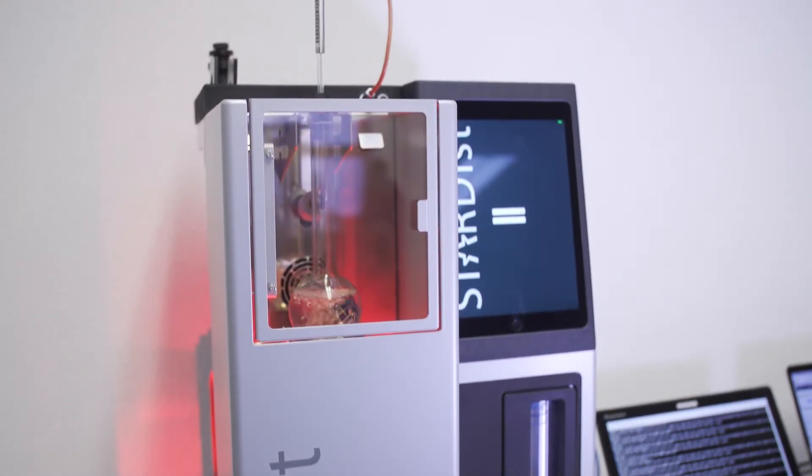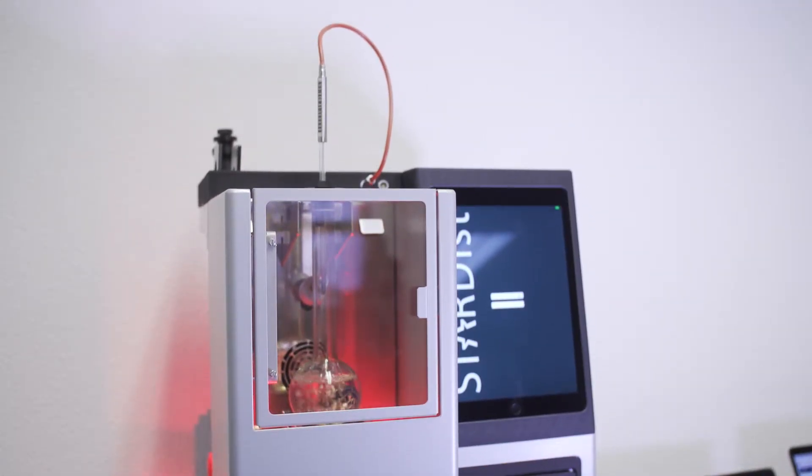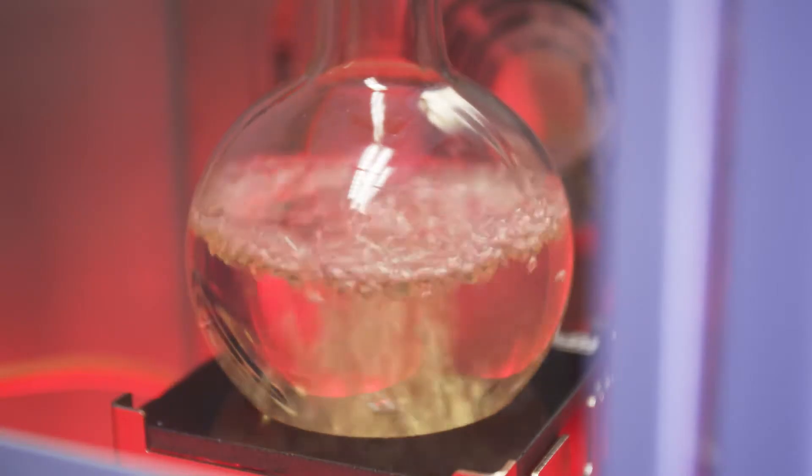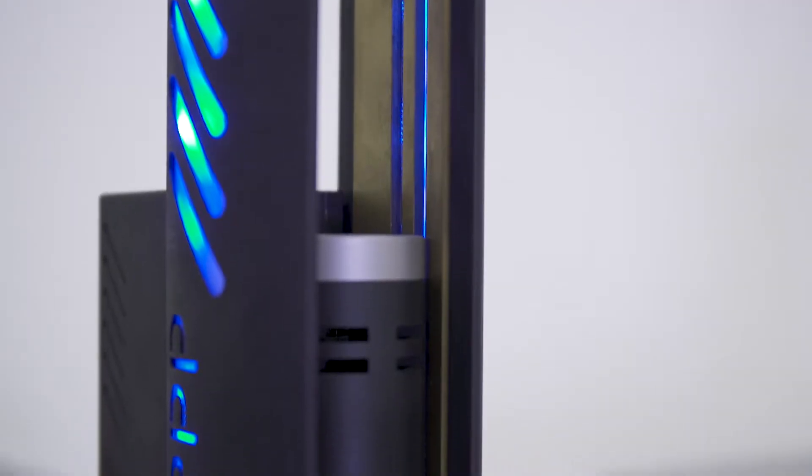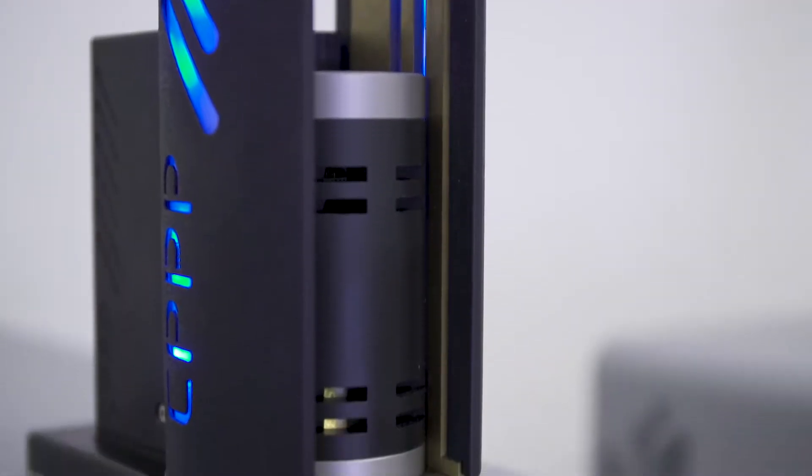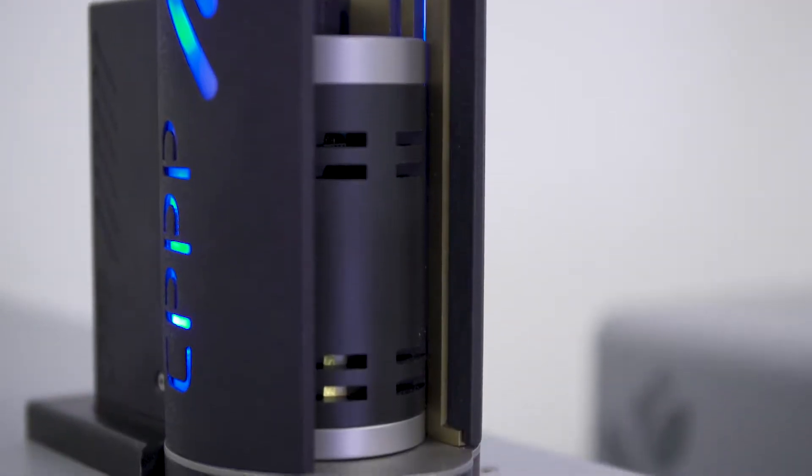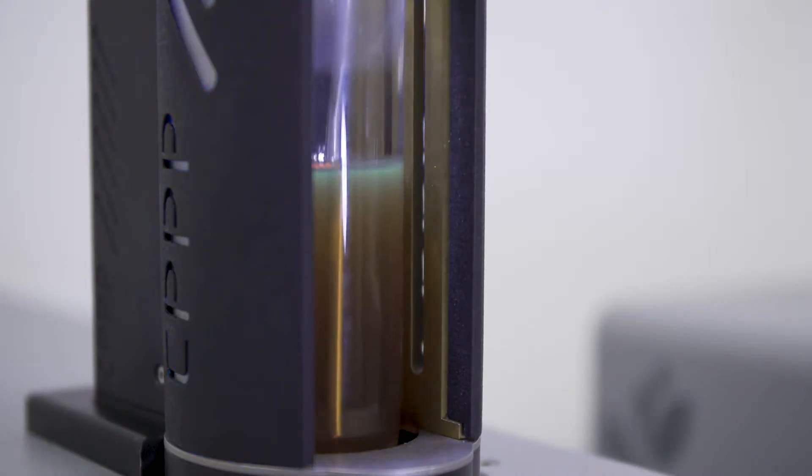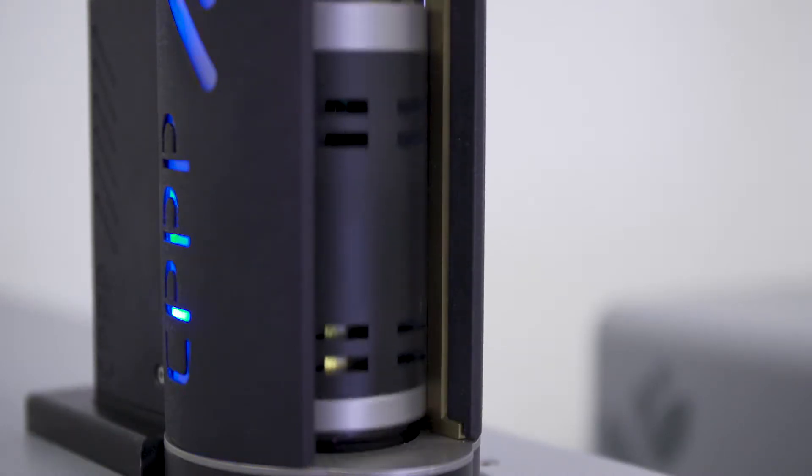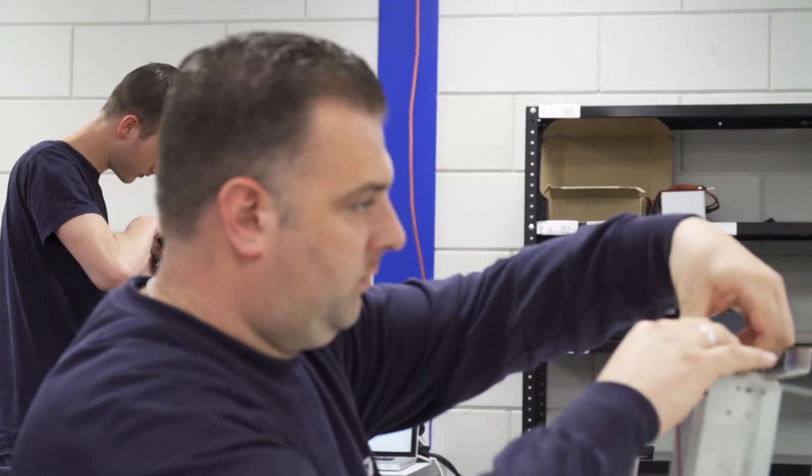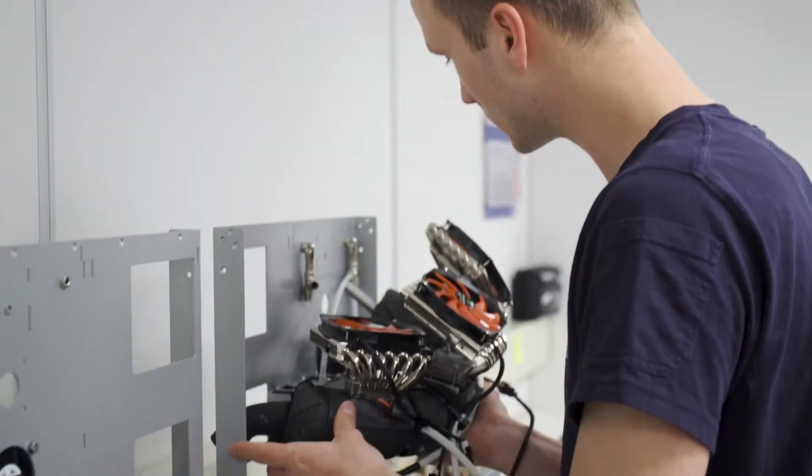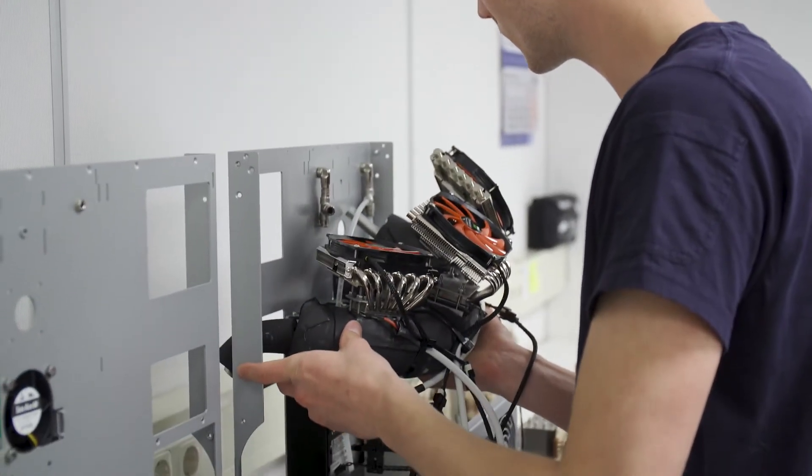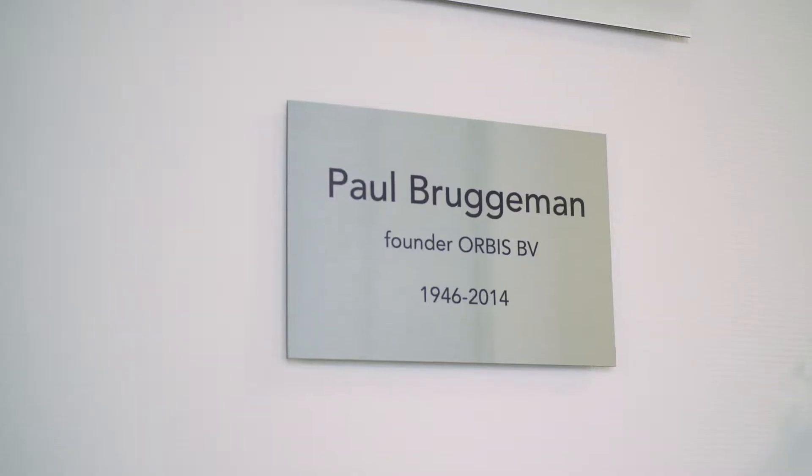Developing and manufacturing instruments for testing petroleum products is Orbis BV's central focus. Top priority is making instruments that produce highly precise, accurate and repeatable test results, immediately followed by a passion for including innovative technology to make the instruments smaller, faster, more reliable and easier to operate.